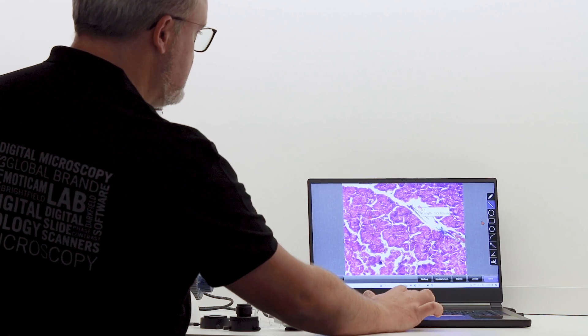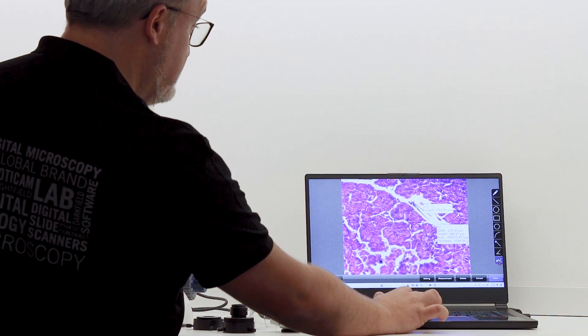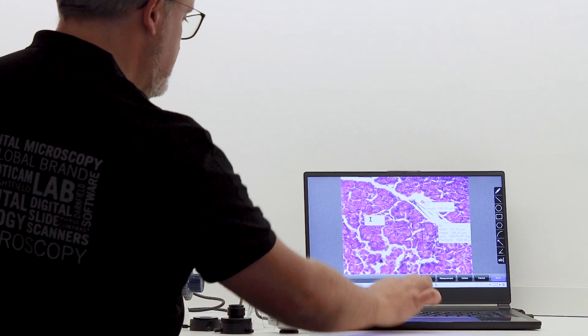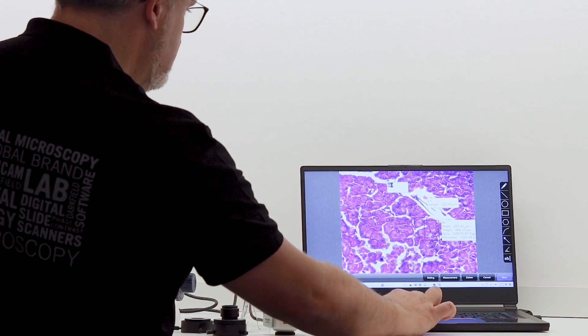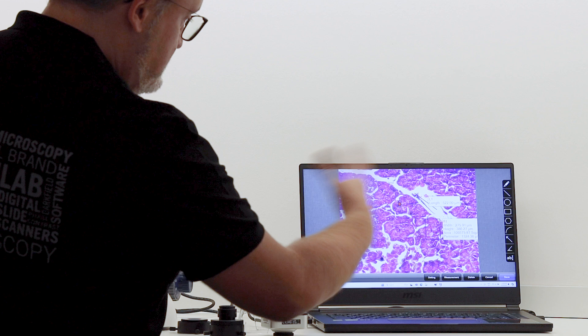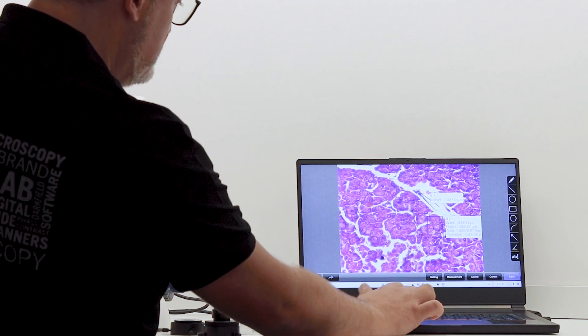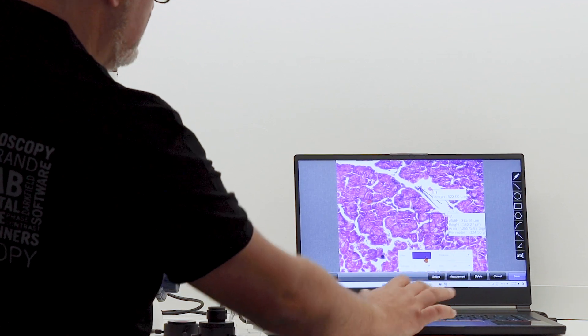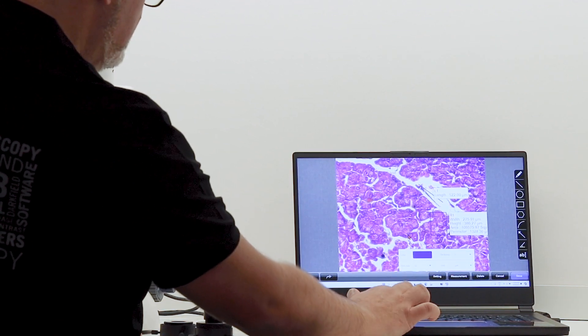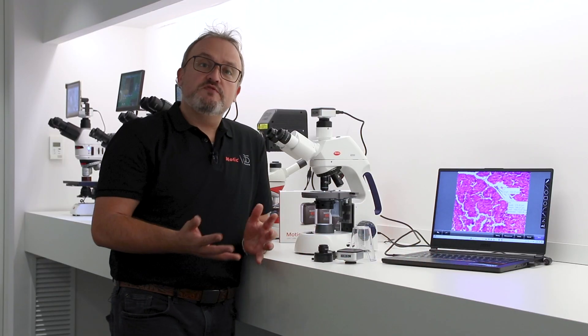I can start measuring lines, boxes. I can then also annotate if I found something interesting. If you don't see, for example, the blue text properly, you can change the color, you can change the thickness of the lines so it can stand out. This is really good for people who just want to do very quick labeling and measuring of certain images.